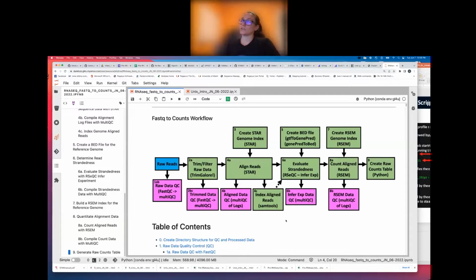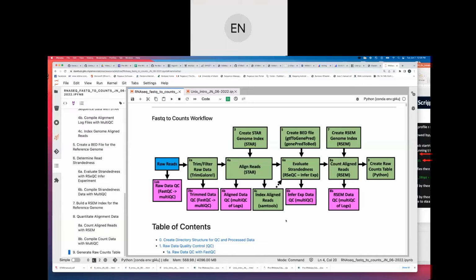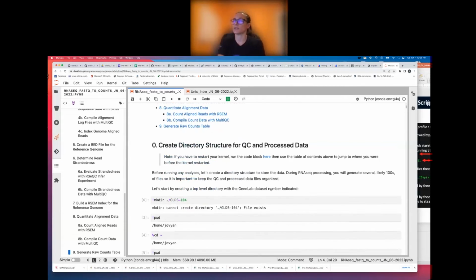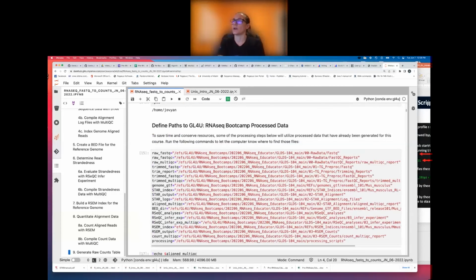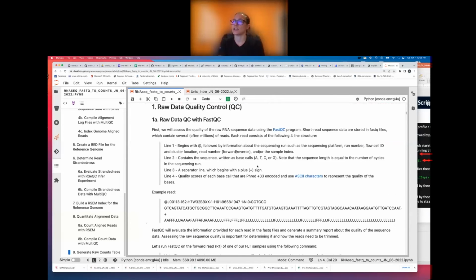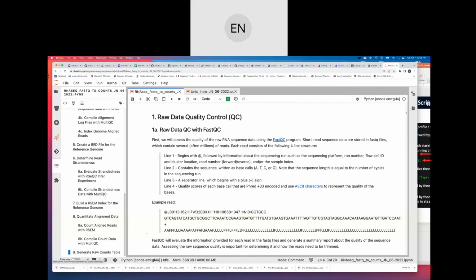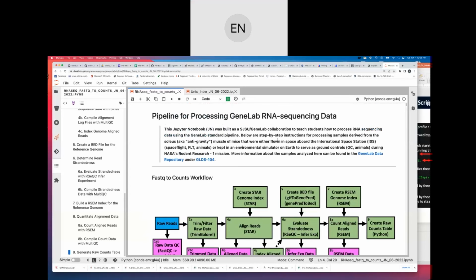For sure. Almost all of these tools are open source, so you could actually view the source code. Are there any of these tools that we use that don't have their code open source on GitHub? And in the documentation, throughout the Jupyter Notebook, the first time I use a tool, I always have a link out to the documentation for that tool. Great. So the documentation will tell you what language. Okay, so I can do that myself then. I could just go through it systematically and annotate that slide. Sure. Yeah, absolutely.